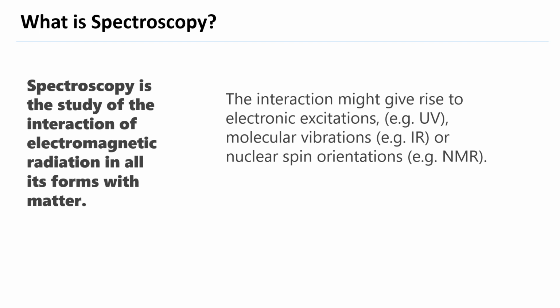But while looking just at the color, we are unable to see which type of molecule is present and how much of that particular molecule is in the solution. So we are unable to give that information to people. And here comes spectroscopy.